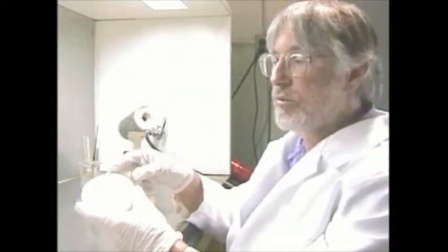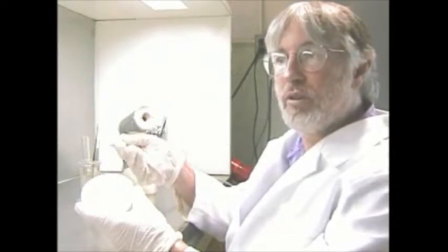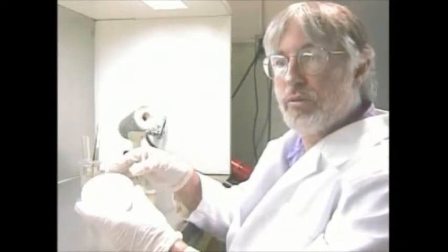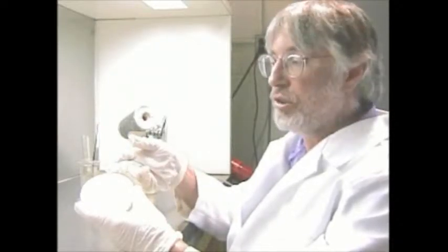And then by changing the nutrient media to a different combination of hormones, that callus can be induced to form somatic embryos. And these are basically very similar in structure to normal sexual embryos, but they are occurring under these plant tissue culture micropropagation conditions.